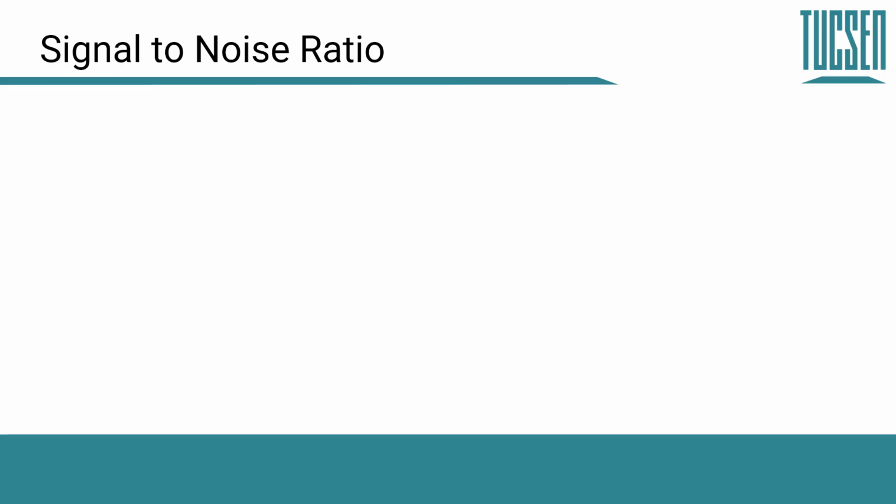So next we're going to look at this really important subject of the signal-to-noise ratio. One way that we can think about the signal-to-noise ratio is the limiting factor on how small our signals can get and where we can still answer our scientific questions. Because as we've just seen with image scaling, if our image is too dark, then we can simply change our scaling settings to see what's there and reveal what's there.